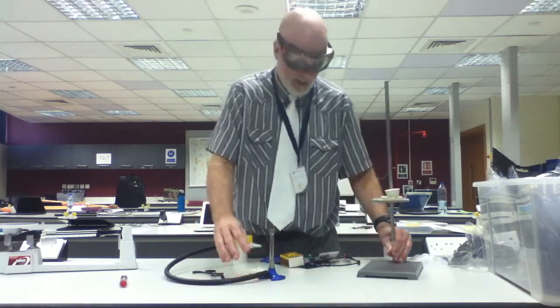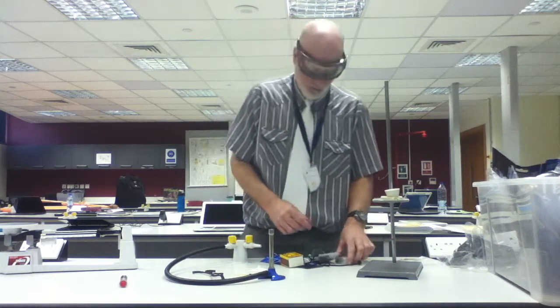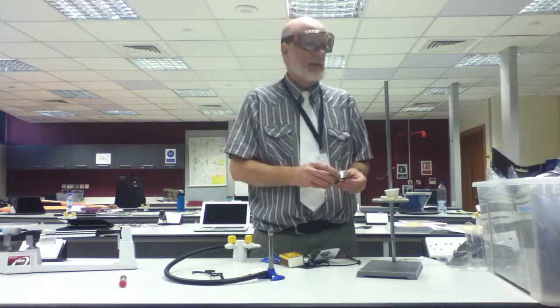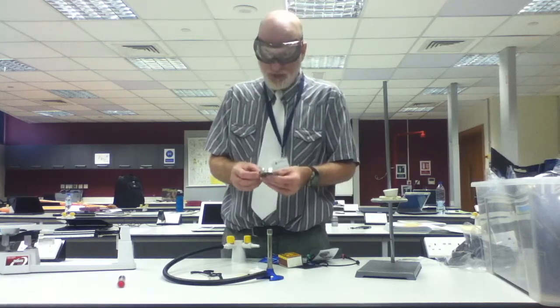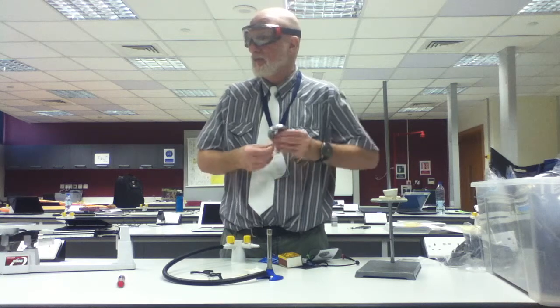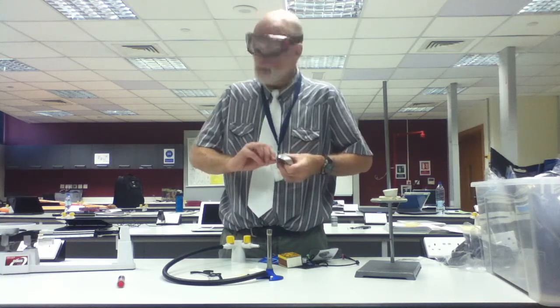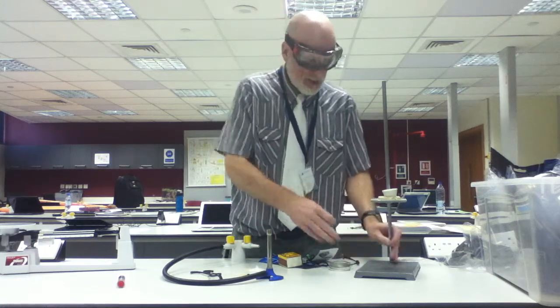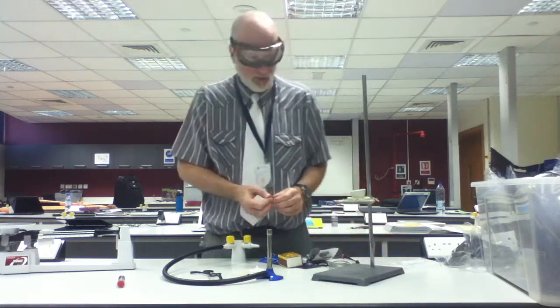That's how you light the flame. Now, what I want to show you is something, and when you burn magnesium, it's like the old photographers, when they used to use powdered magnesium to flash, okay? I'm going to show you the actual reaction that's occurring. This is the actual reaction that's occurring, okay?